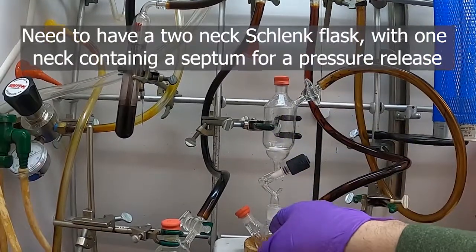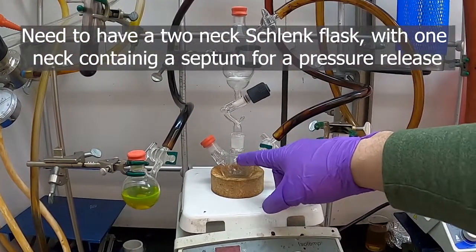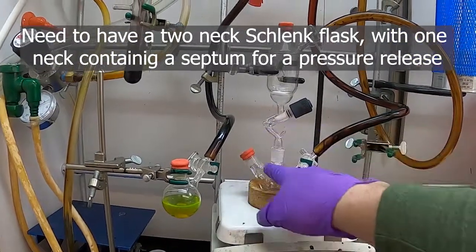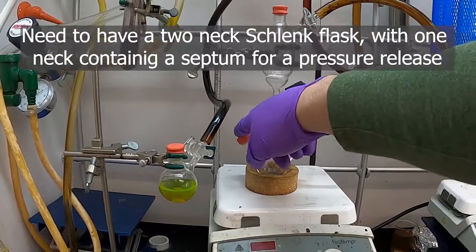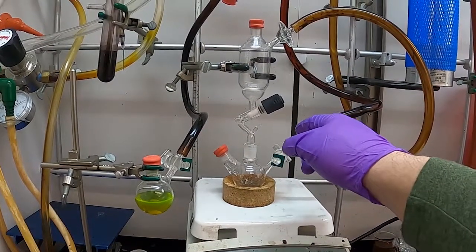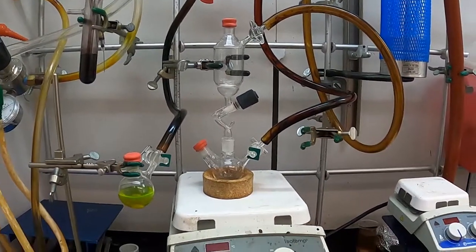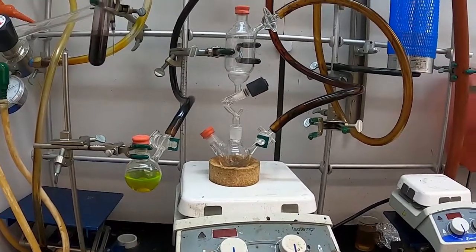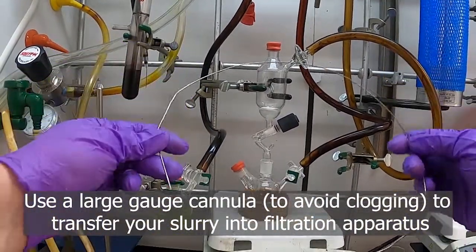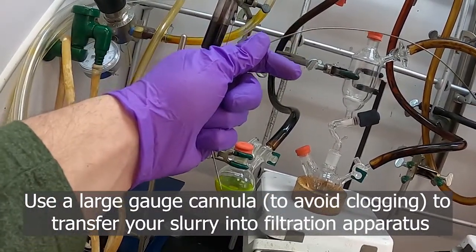The way this works is we need to make sure we have an outlet for gas in our receiving flask. It's best if you can have a two-neck flask to catch in, so that you can have a place to put a bubbler. Otherwise you have to fiddle with putting a septum on at the end of your Schlenk stem and putting the bubbler in through there. So what we'll do here is take a regular cannula.